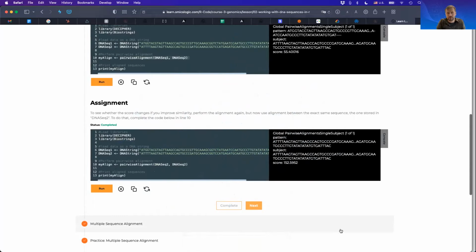And Sanjay and Raphael, you were asking how to run this on your computer, right? Obviously, this isn't something where you could know that you've run it correctly, because our system allows us to check on the back end that this is done exactly the same.